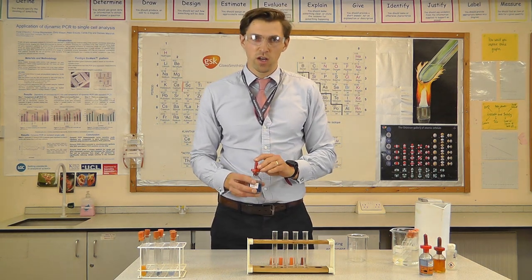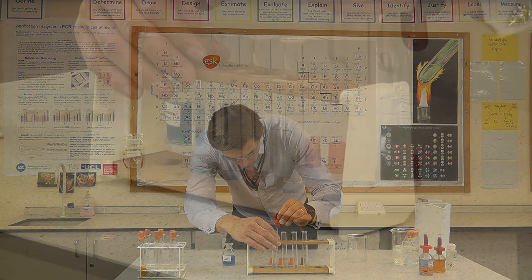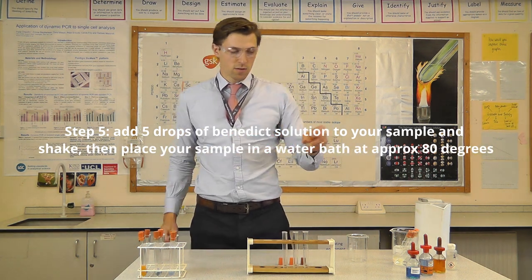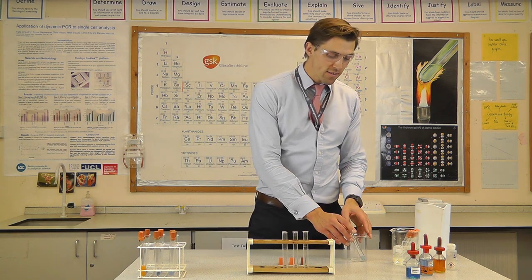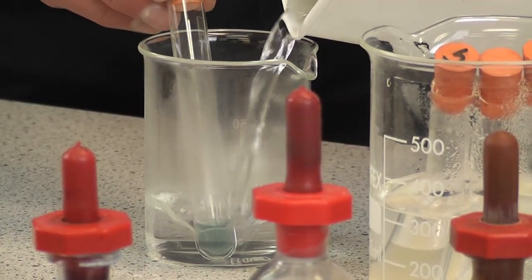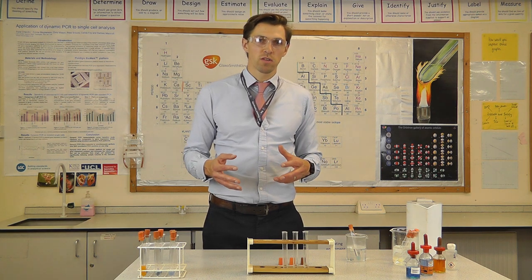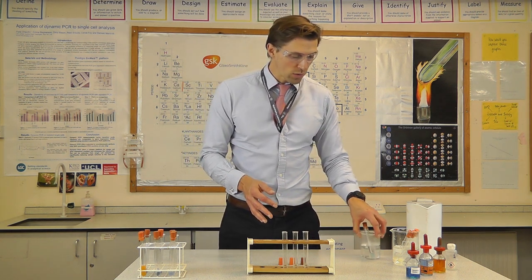We'll get the Benedict solution done first because we need to put that into a water bath. I'm adding approximately five drops into the test tube. Benedict solution starts off a very vibrant blue. After being in the water bath, if it turns yellow, orange, or even red, that indicates the presence of glucose. We're expecting the biscuit to definitely have glucose, so it should change relatively quickly. A brick red colour indicates a large percentage of sugar; yellow indicates slightly less.